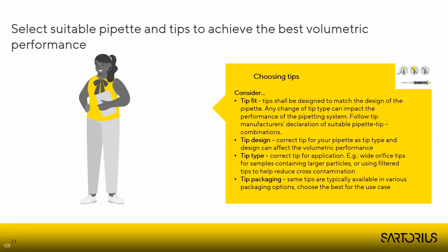And then on the direct impact side, I would definitely focus on reducing the plastic where we can. For example, using the refill option tips when possible, because they are typically packed in cardboard. This helps reduce the manufacturing impact as well as disposal impact, because there's less plastic overall. And refill tips are typically also packed more tightly, meaning that there are more tips in the same space, which means that the transportation is more efficient as well.